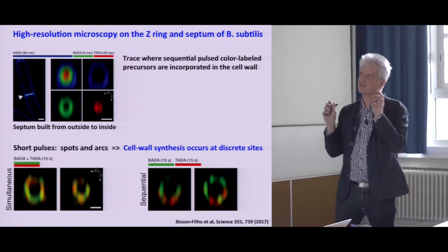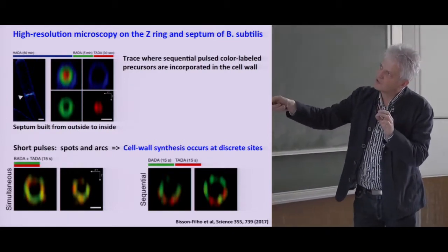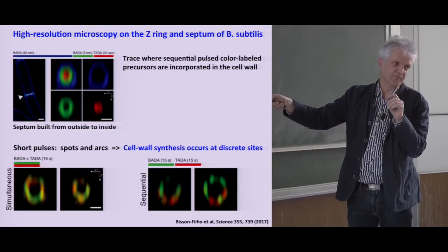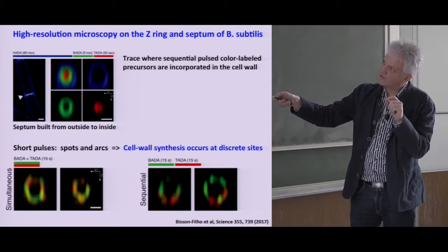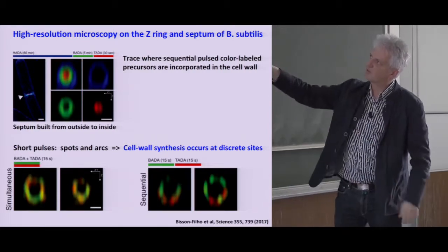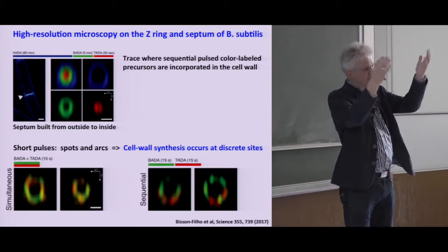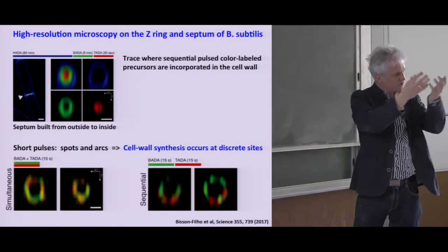And that's quite interesting. From Yves Brun's work, what we could do is to image in cross-section this E. coli. This actually is done in Bacillus, a different bacterium, Bacillus subtilis. You build that cell wall in the center, starting from the outside to the inside. With different colors, we could color code the cell wall that's being assembled from the outside to the inside. And you can see the blue, the green, and the red being assembled from outside to inside.